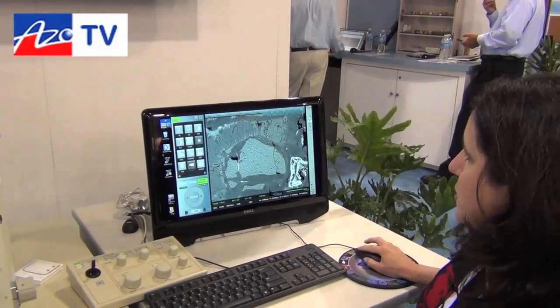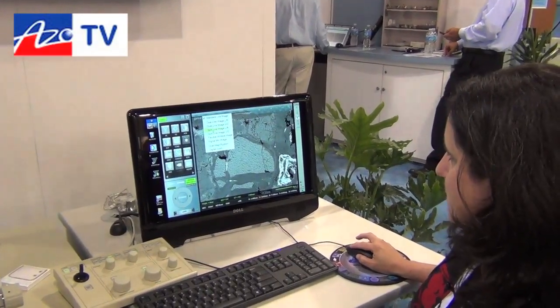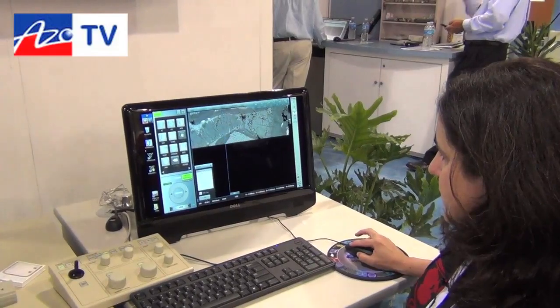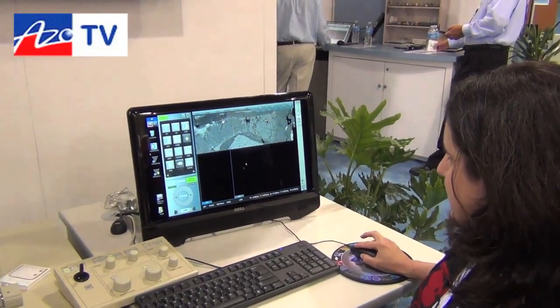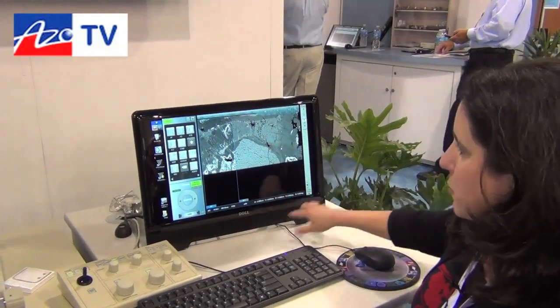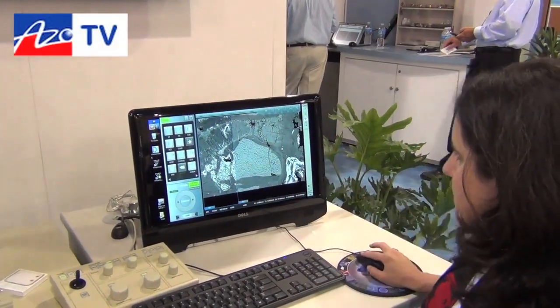Now I have a different view of my sample where the grayscale has more to do with the composition of the material. I can actually have two detectors going at the same time — I'm going to choose secondary on the left and backscatter on the right.